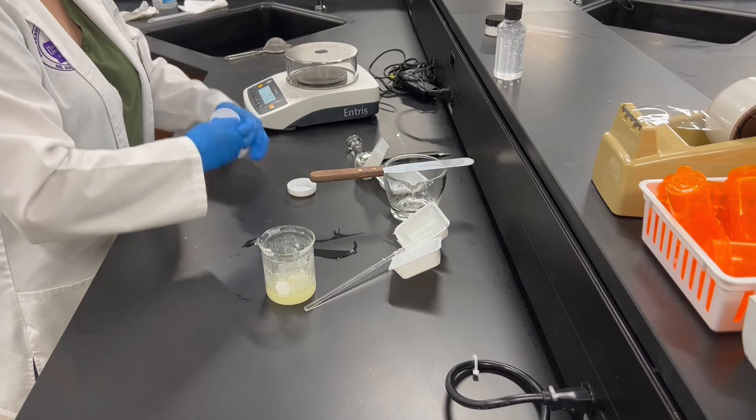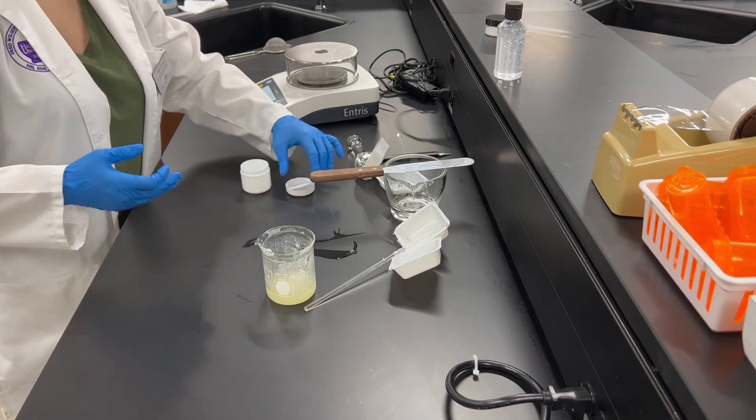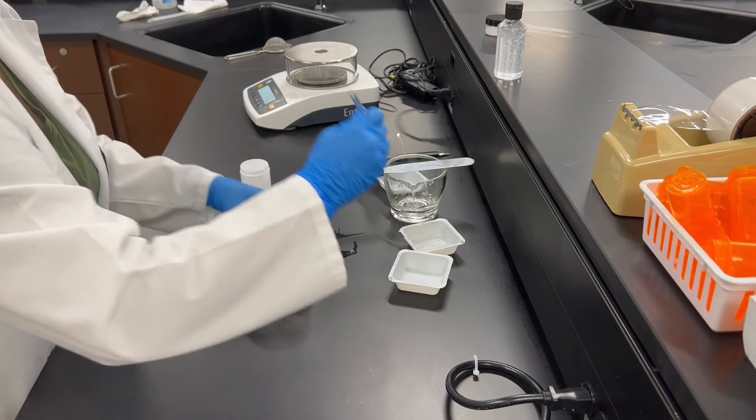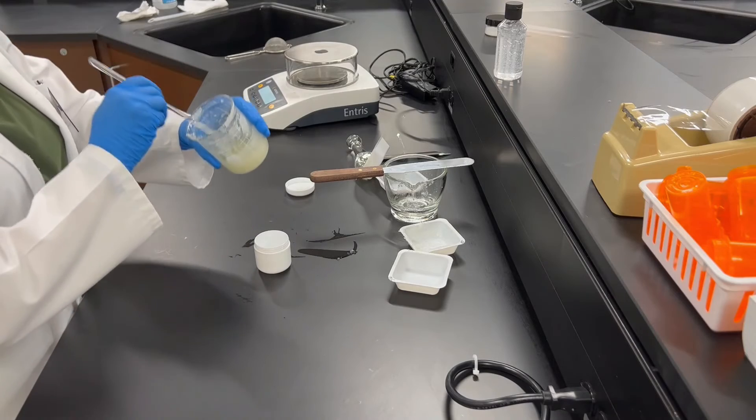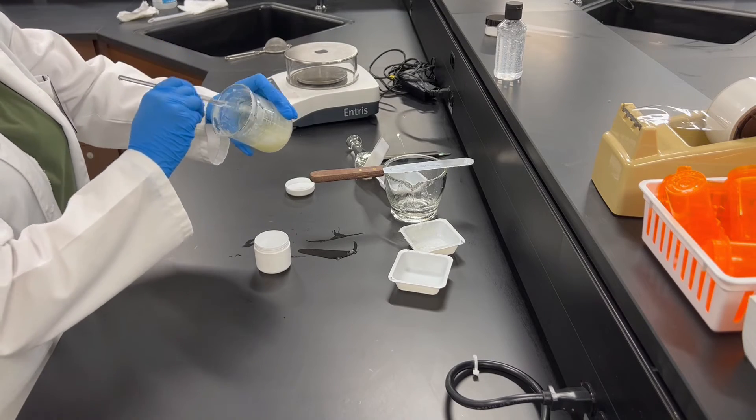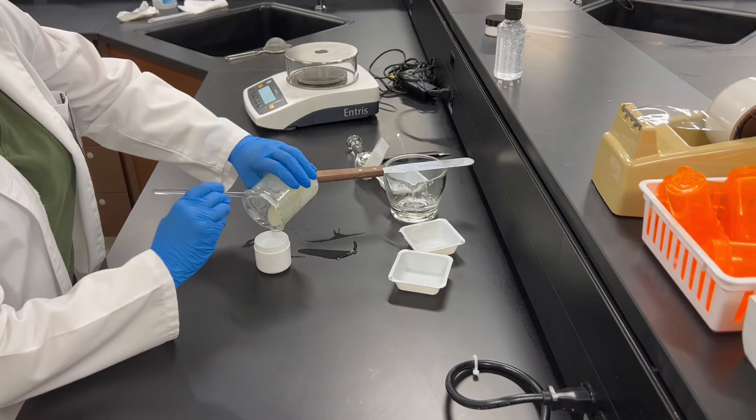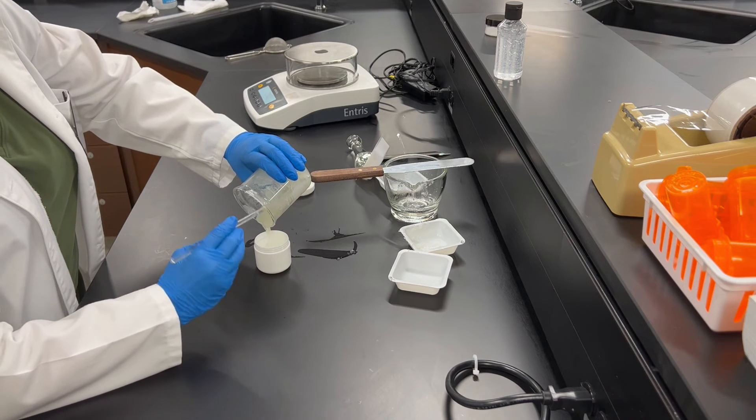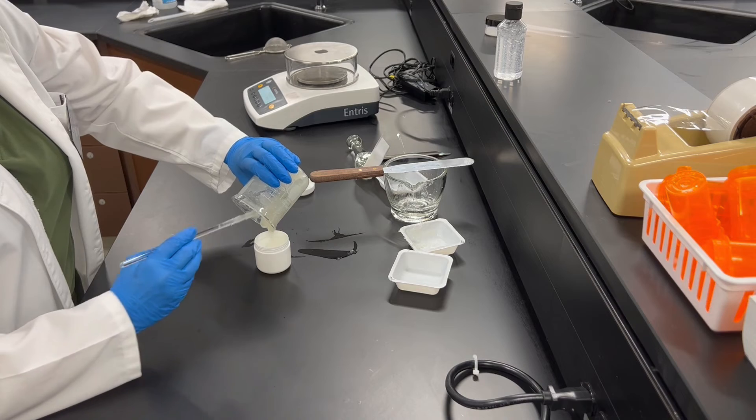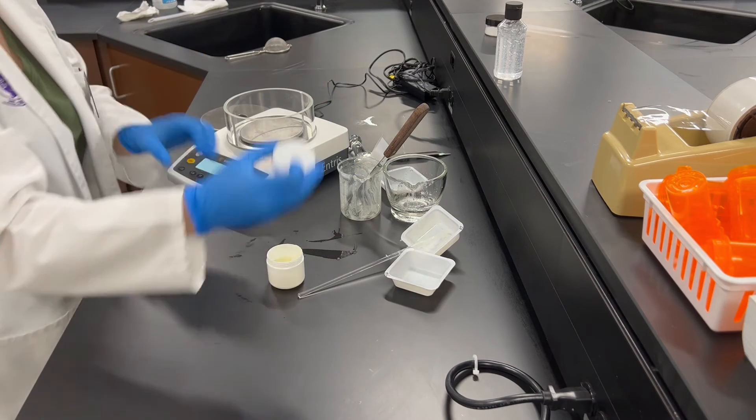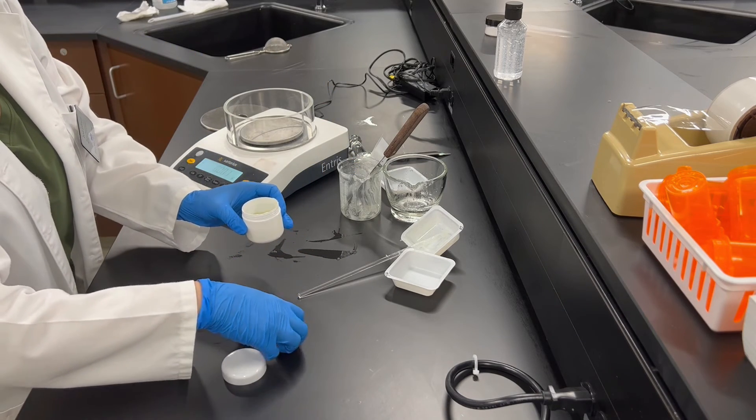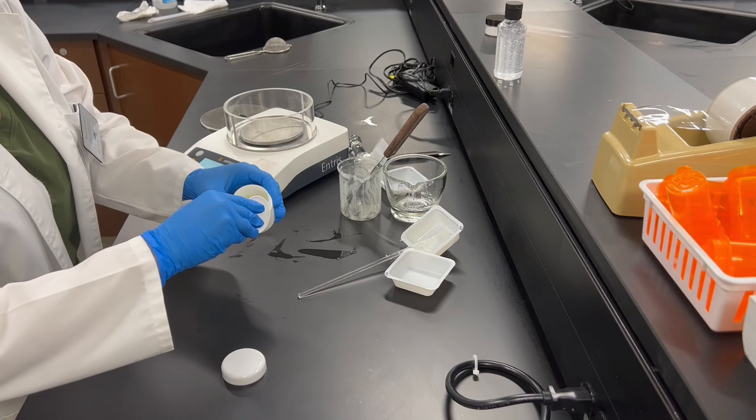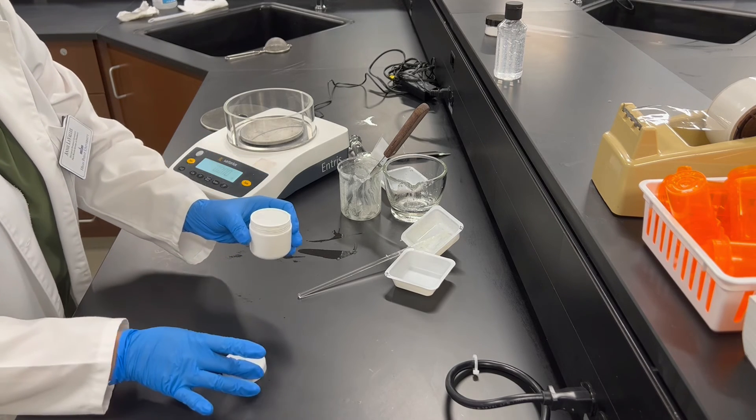Then you can go ahead and take your empty ointment jar, and then you are going to put your ingredients from the beaker into the ointment jar. You can take it out with the stir rod or you can use a spatula as well. Either one works, but the spatula will help you in the long run. Once that is all out of the beaker, you can go ahead and cap that.